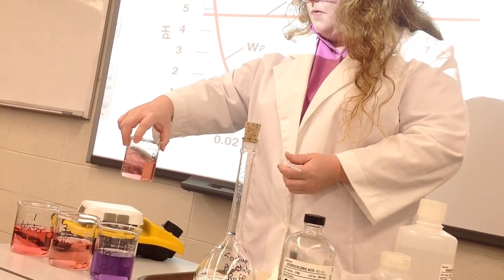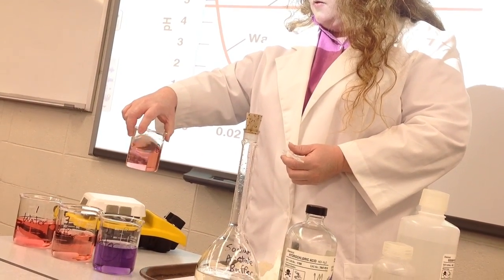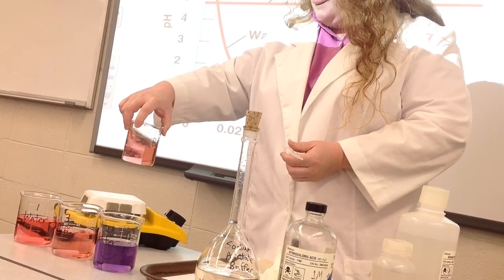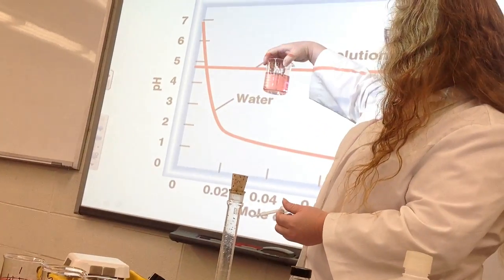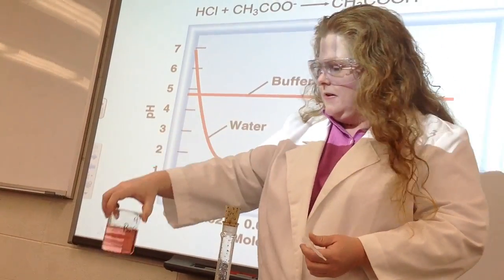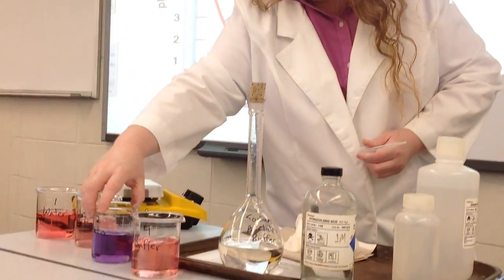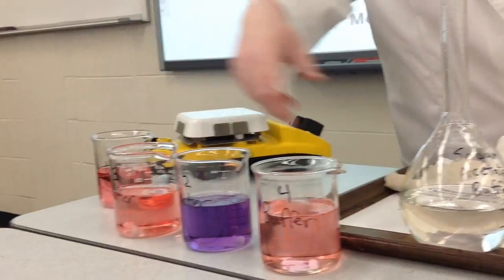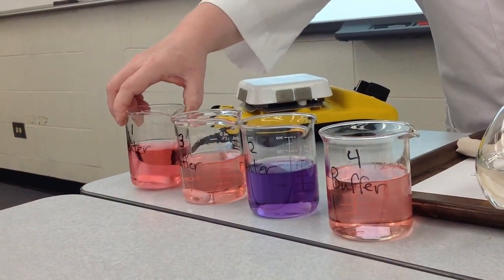Added in a whole dropper full of sodium hydroxide and it's still pink. Okay, so as you can see, with the buffer, okay, absolutely no change in pH.